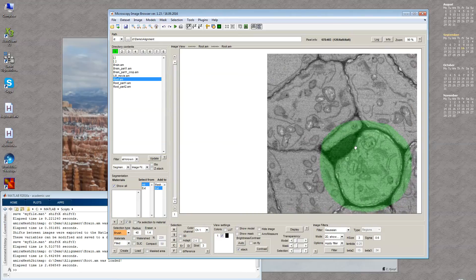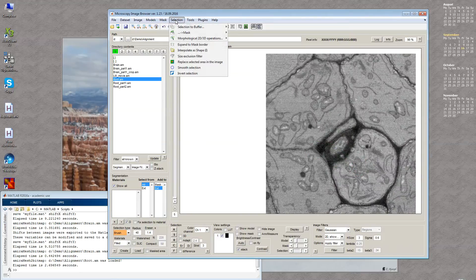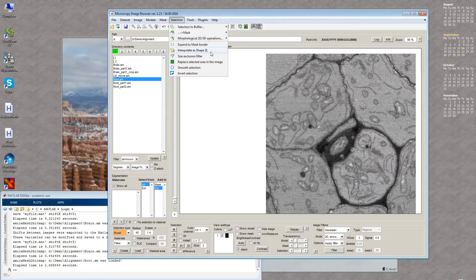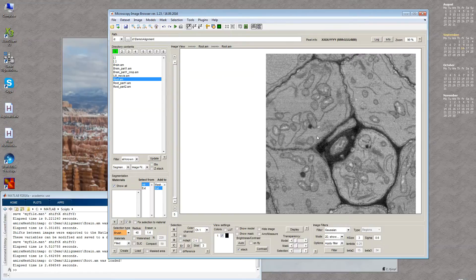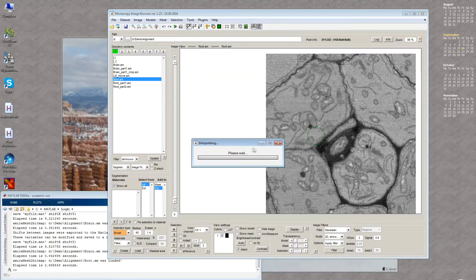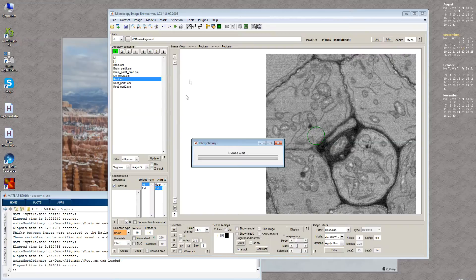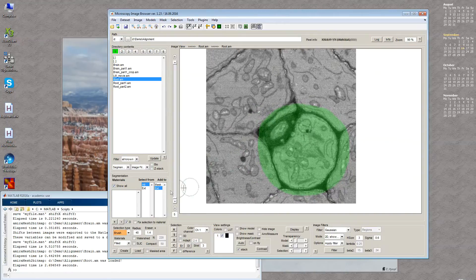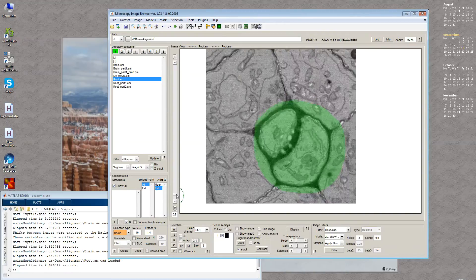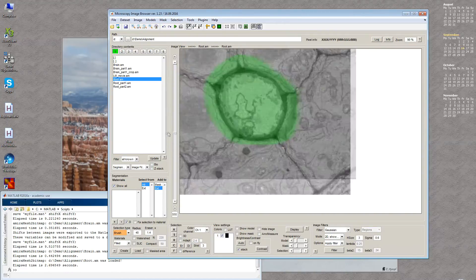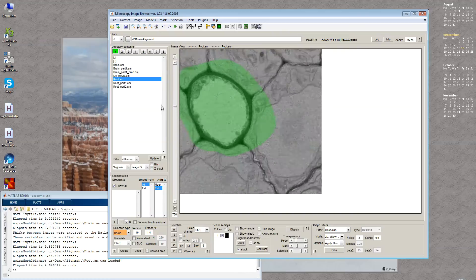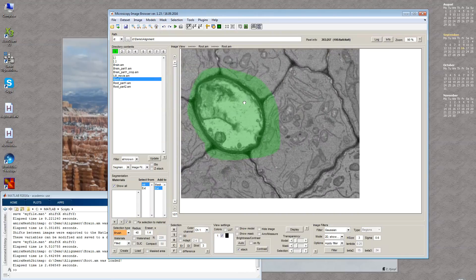Now I can fill these gaps by going to Selection Interpolate or using the I shortcut. The algorithm fills the gaps between the selected areas I drew and does it for all thousand something sections of this dataset. Now it's done and we can see it follows the cell of interest pretty nicely.